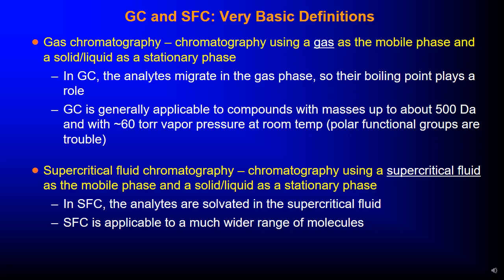And supercritical fluid chromatography. So here supercritical fluid is the one being used as the mobile phase and a solid or liquid as a stationary phase. So in supercritical fluid chromatography, the analytes are solvated in the supercritical fluid. Then it is applicable to a much wider range of molecules.